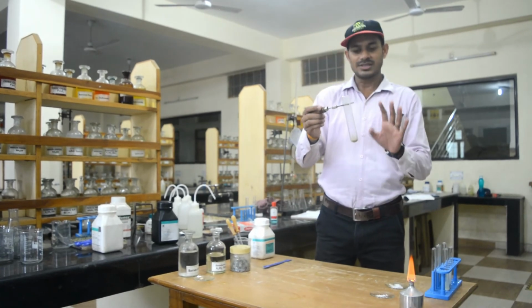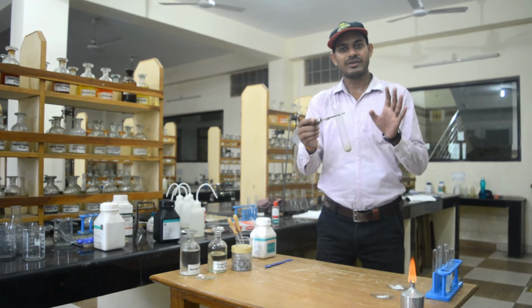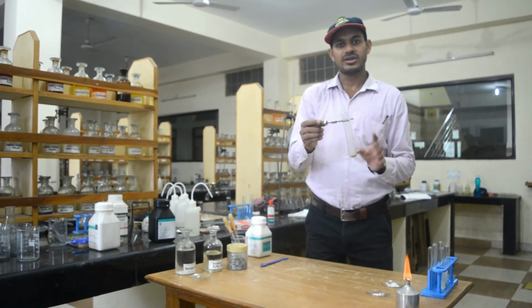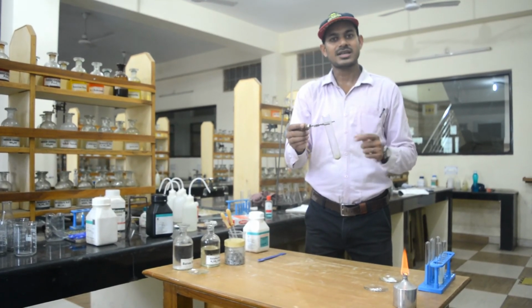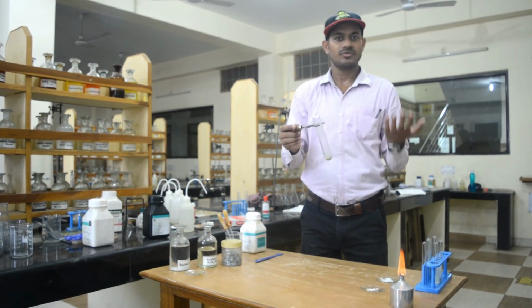So this is all about chemical reactions and equations. Today we have seen the combination reaction, decomposition reaction, displacement reaction, and double displacement reaction. In the next class, we will see some more reactions related to our topic.